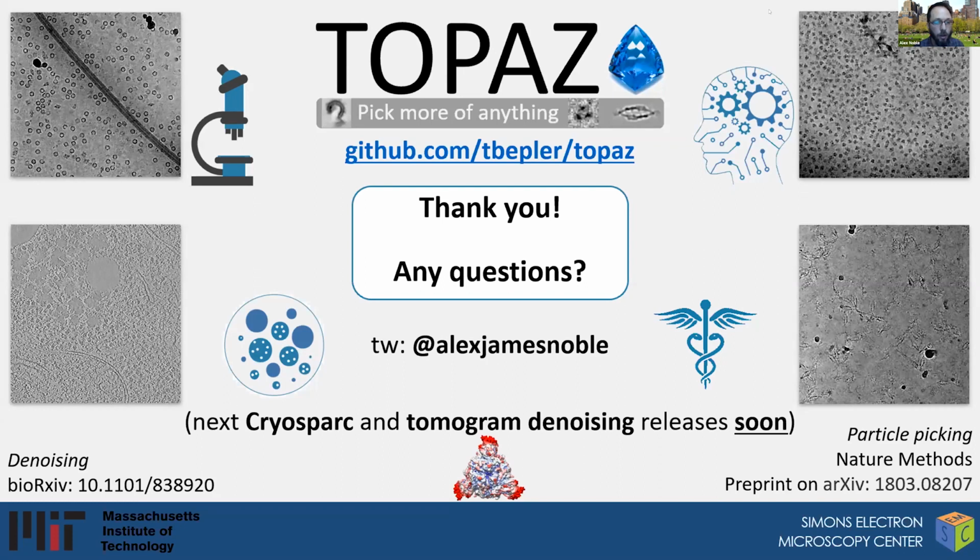It tries to estimate the fraction of area inside of each of your micrographs when you're training as actual negatives, and therefore it picks up the remaining positives. So I don't have the detail on that. You can look in the supplementary of the picking paper, which has a lot of that information. If you have individual questions, you can email Tristan Bepler. He has the knowledge in this area. Yeah, okay, thanks.